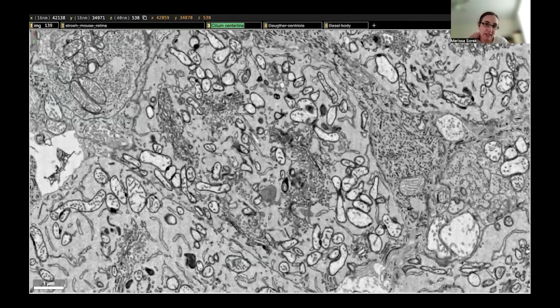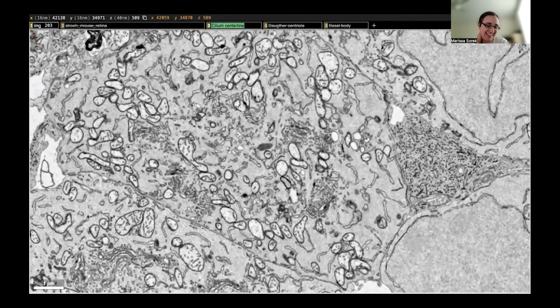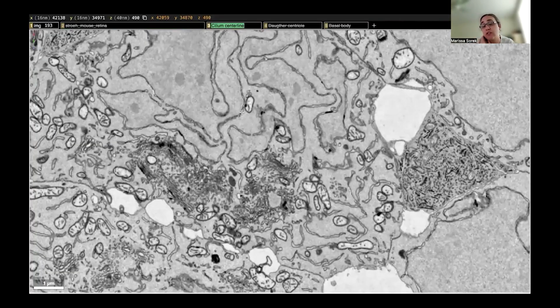While Celia's looking here, I'll mention that when Celia was looking at the cilia that were present outside of the soma, we saw them sticking out, and they were just long, skinny tubes. So they don't have anything like a bouton at the end.